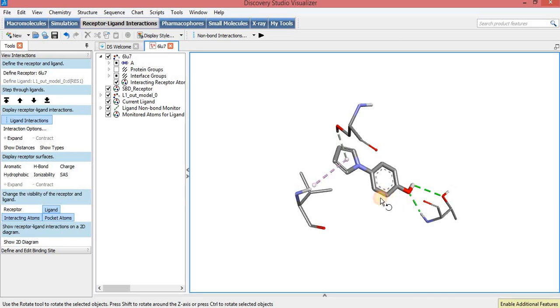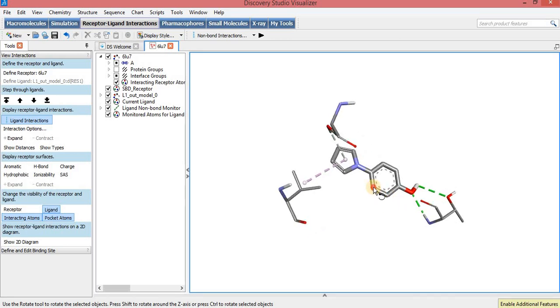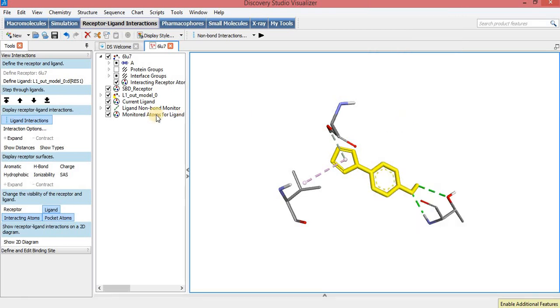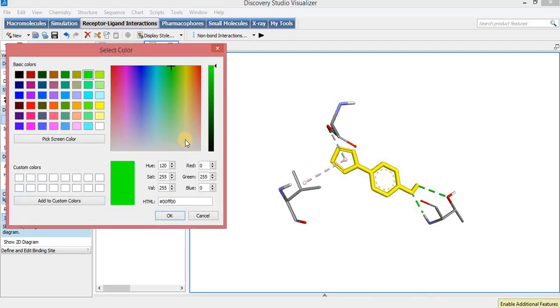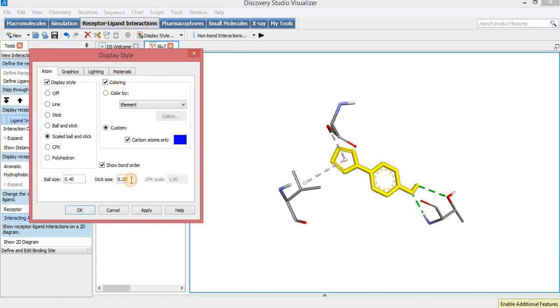To change the display style and color of the ligand, select it, then right-click. These are the different display styles for the ligand; I will select Scale Bar and Stick. I will color only the carbon atoms so that other atoms like oxygen and nitrogen can be easily differentiated. I will select blue color for the ligand and also change the stick size from 0.20 to 0.30.